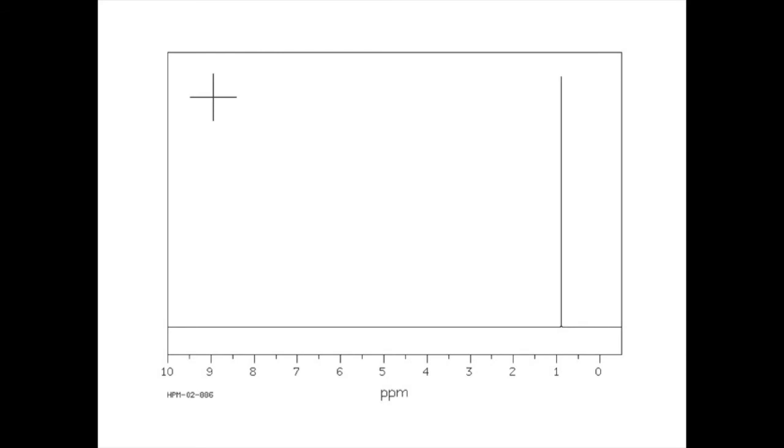So in the spectrum for this molecule, we see a singlet in the alkyl region right at 1 that will account for all 12 protons in our molecule. Notice that there's no integration provided in this spectrum because the area under this peak doesn't have any other peaks to be compared to. So all protons are accounted for in this one signal.